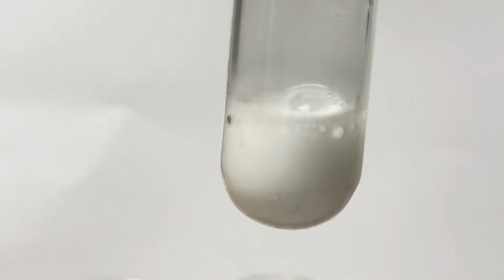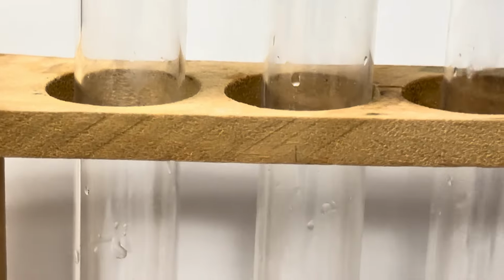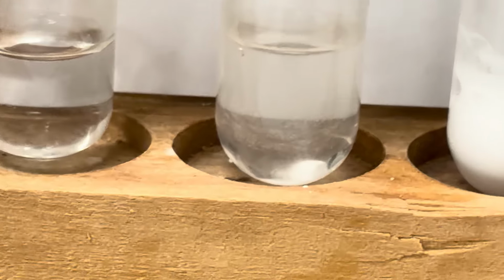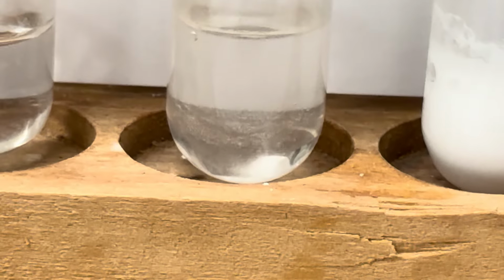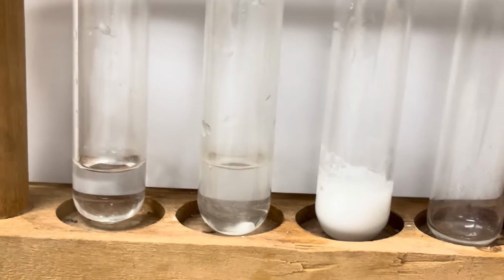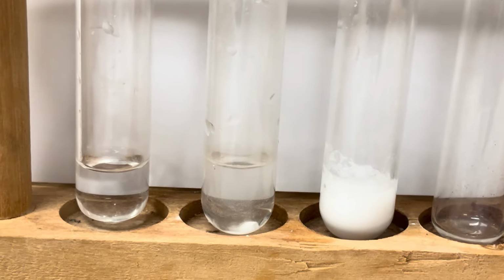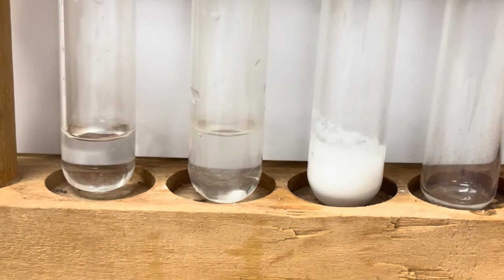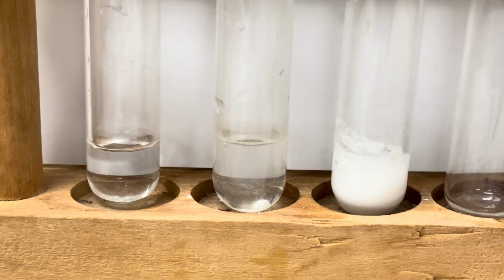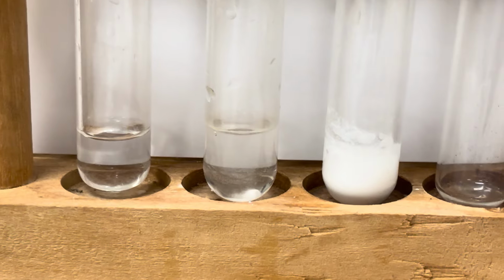My calcium carbonate, I don't know that that's dissolving at all. Doesn't really look like it is. That's definitely getting smaller. Yeah, we can see it getting smaller. So that's interesting. The one on the left dissolved the easiest. The one in the middle is also dissolving, but it seems a little more reluctant. And the one on the right seems to not be dissolving at all, at least so far.